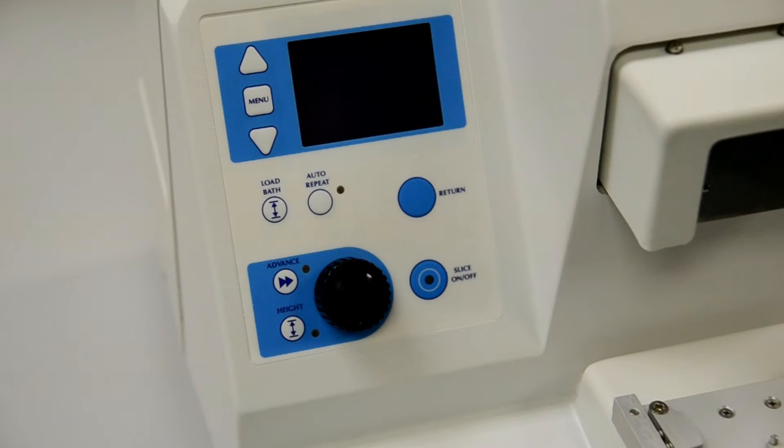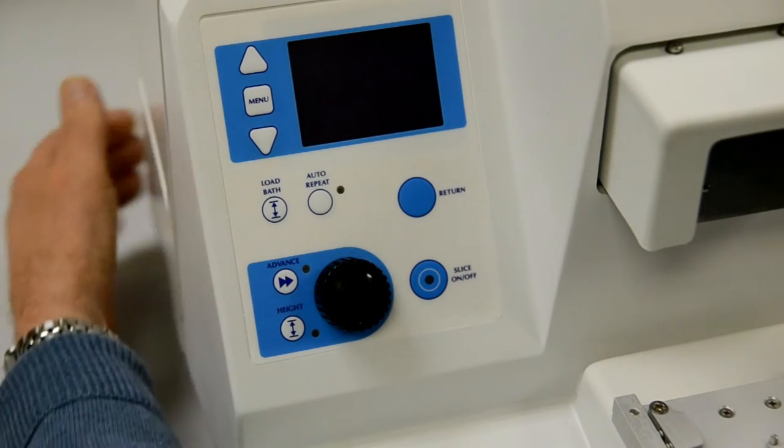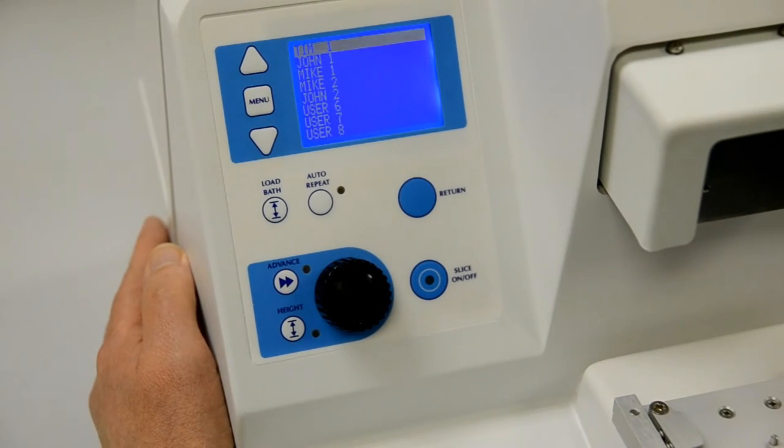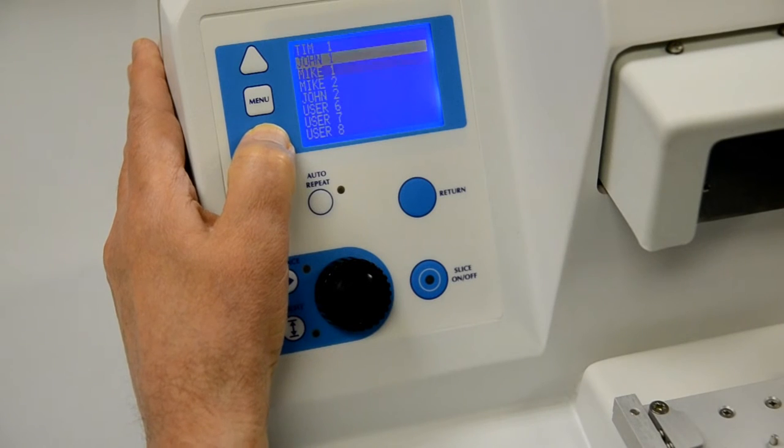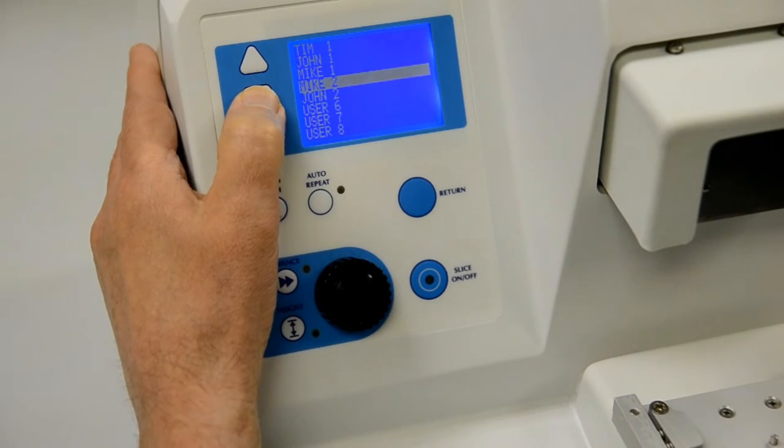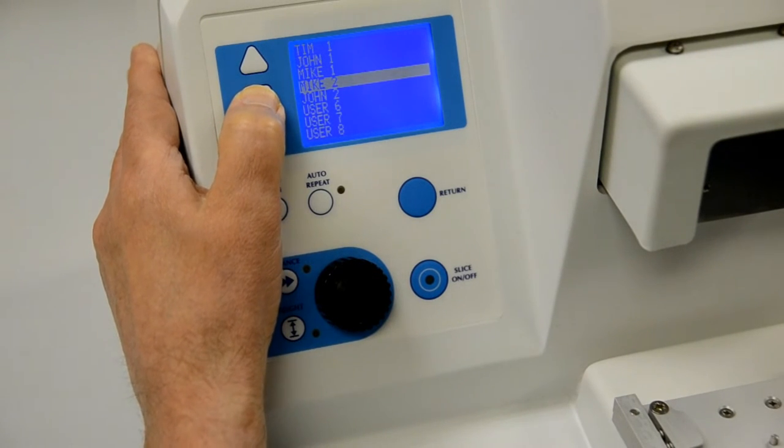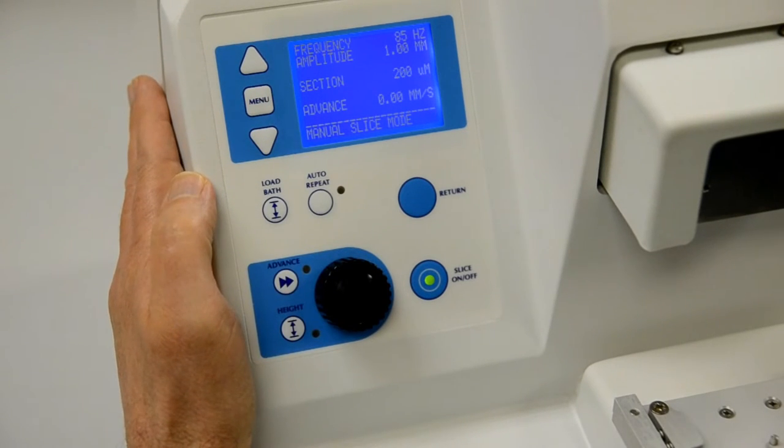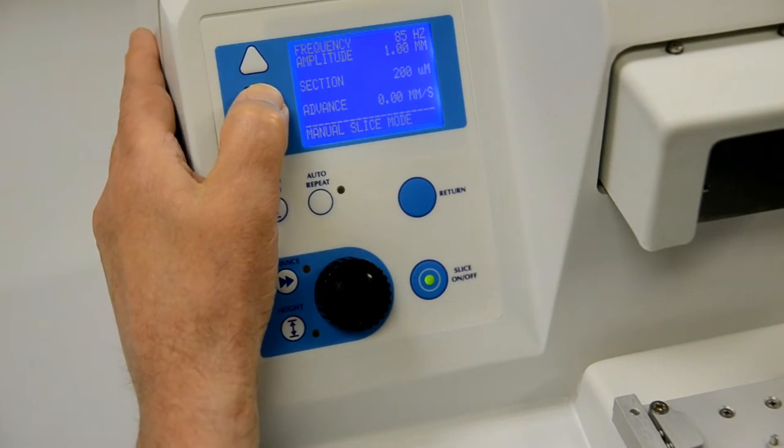The slicer memory can retain up to eight user names and their preferred operating parameters. When the instrument is switched on, the display will show a list of previously stored users and any unused slots. To select an existing user together with the operating parameters that were last used, simply use the up-down arrow keys to highlight and then press the menu key.